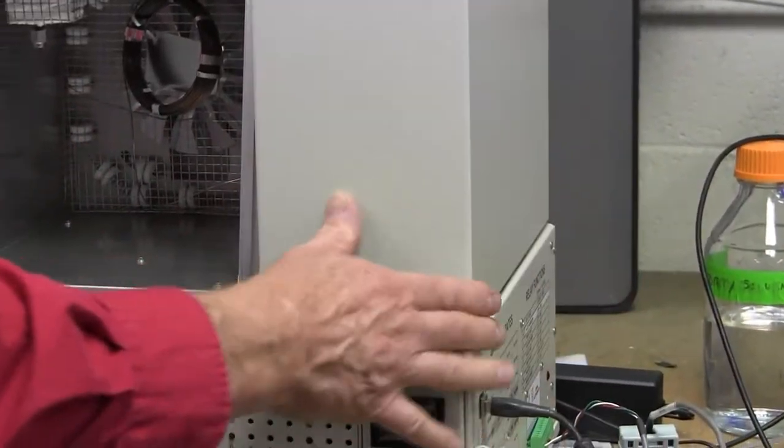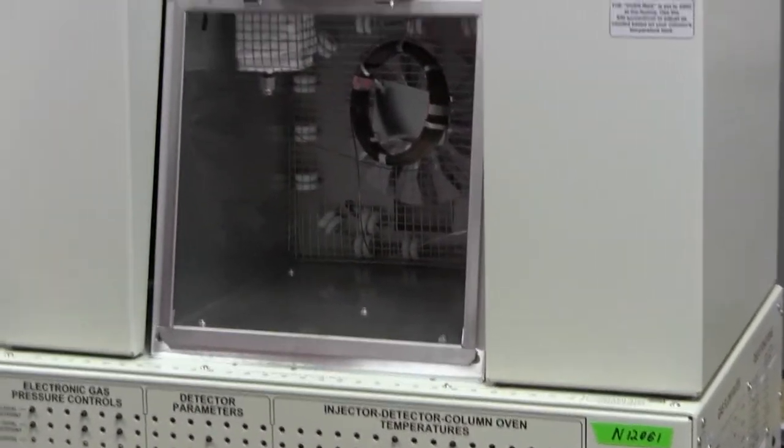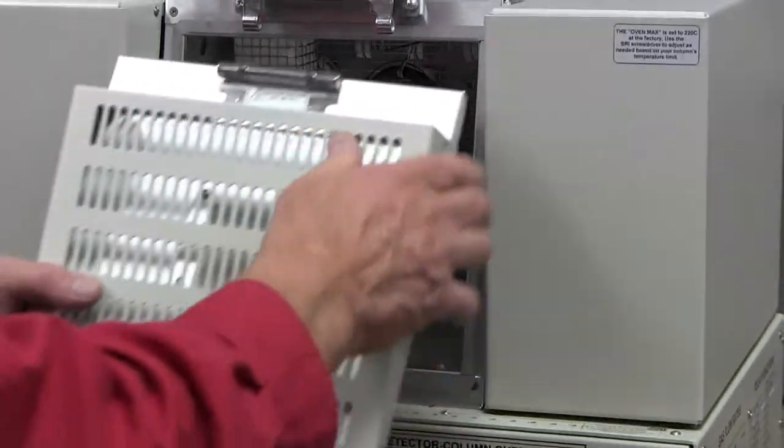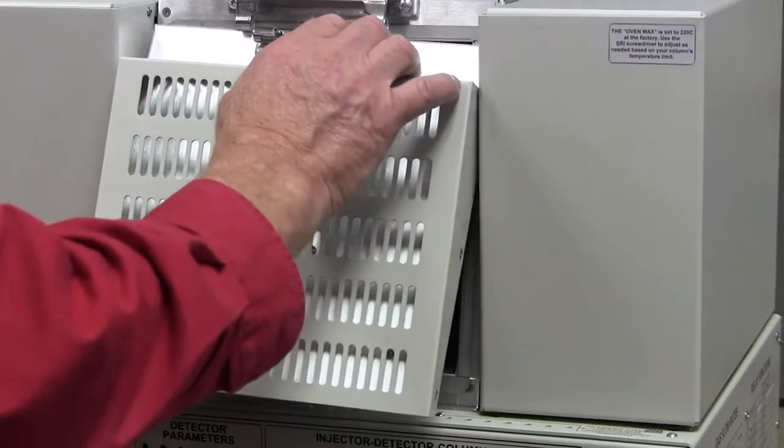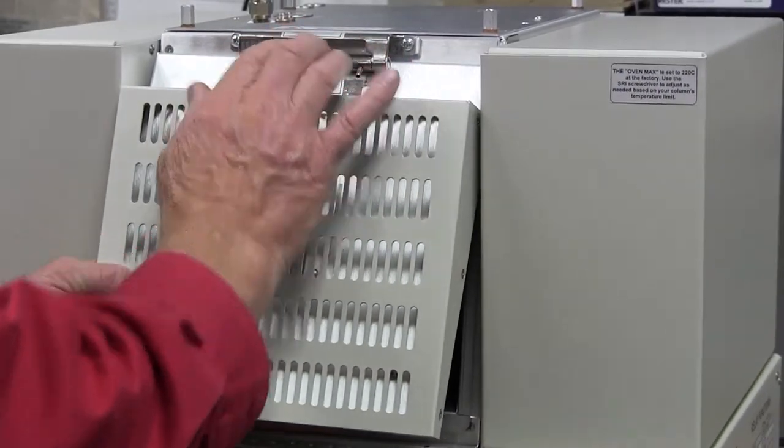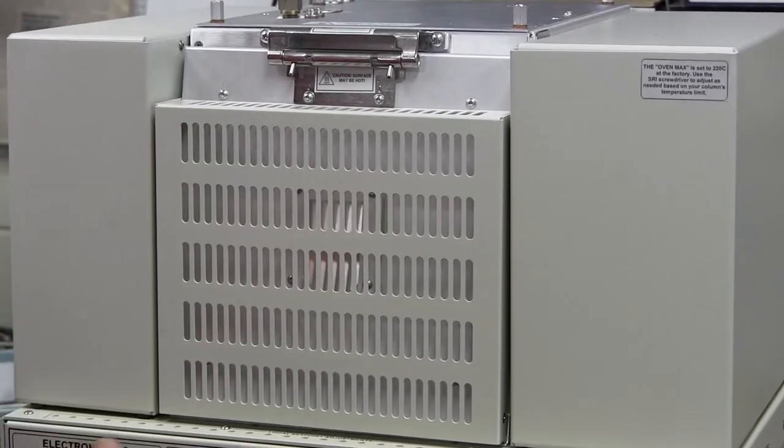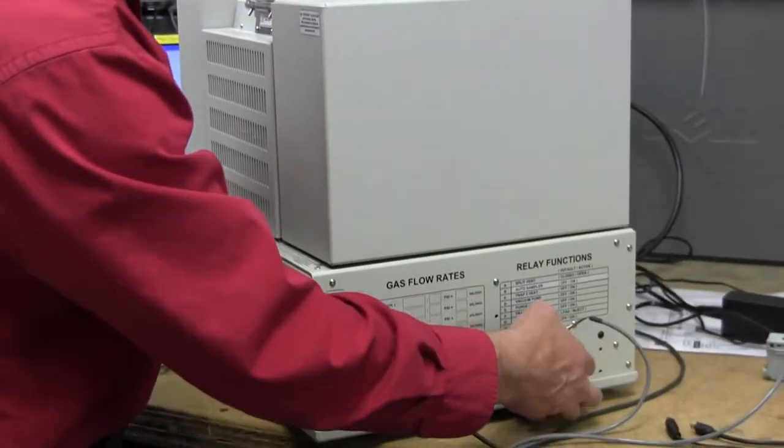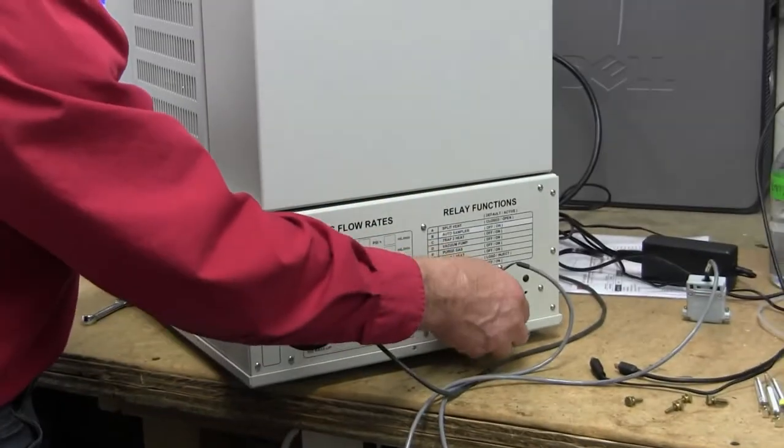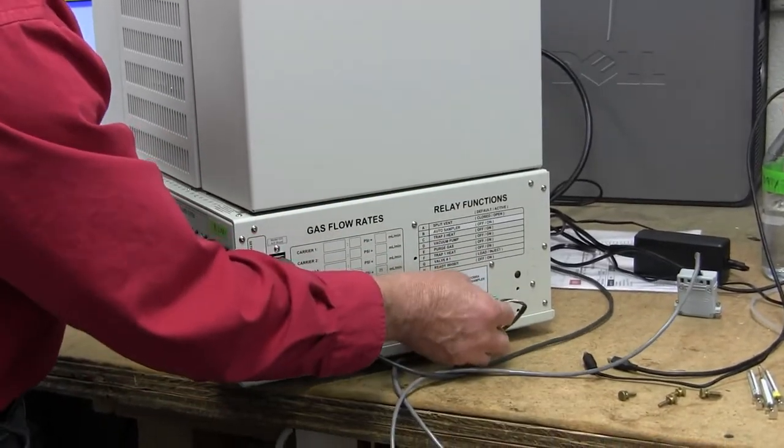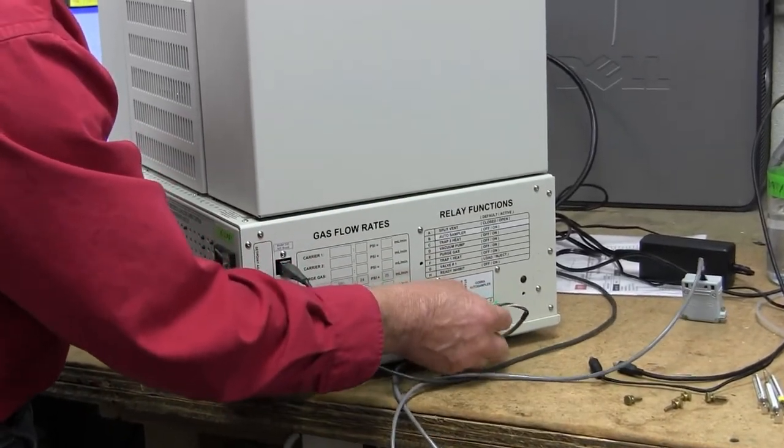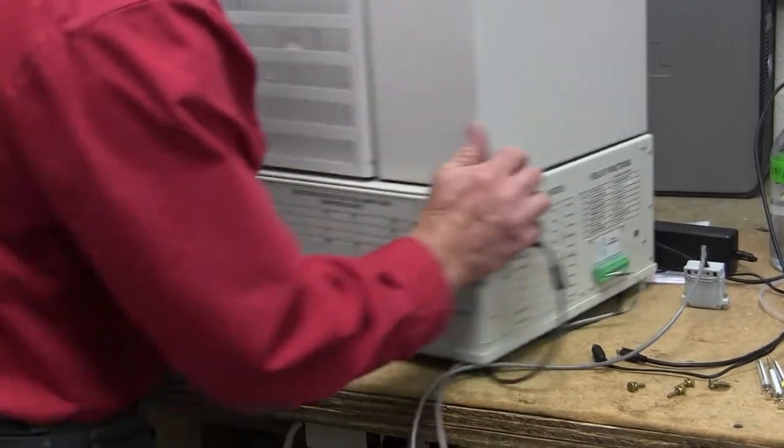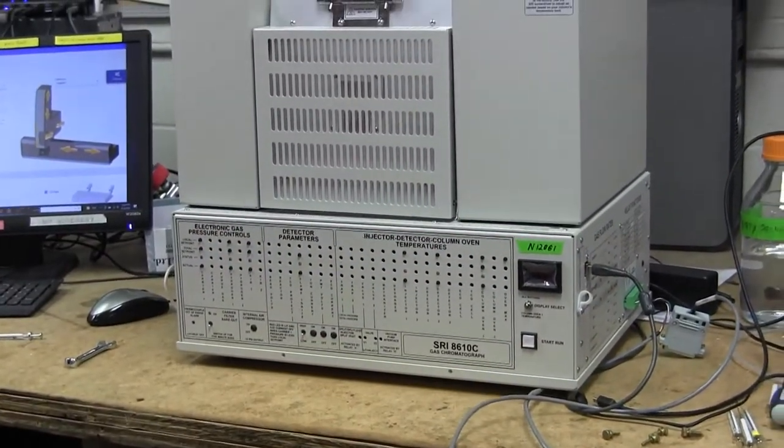So we don't really have to talk too much about the GC, just that when it's in this format which is the vertically oriented oven format, there's always the interface provided so that an auto sampler like this can be connected after the fact. It doesn't have to come back to the factory, the auto sampler can just be added at any time.